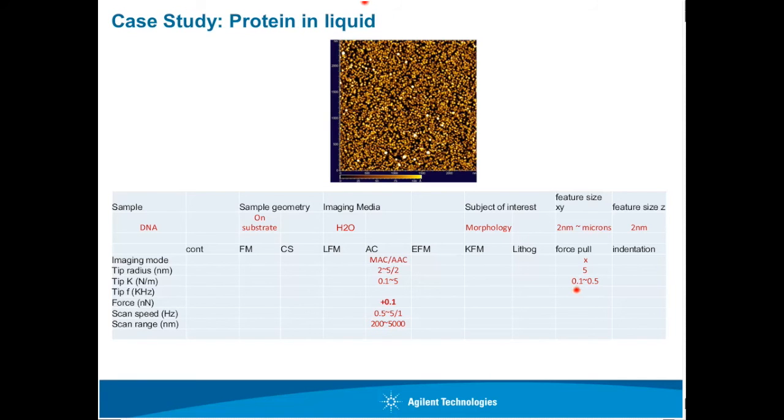Another sample, protein imaging in liquid, is very similar to DNA imaging in liquid. And actually, all the parameters are very much the same. They have very similar characteristics.